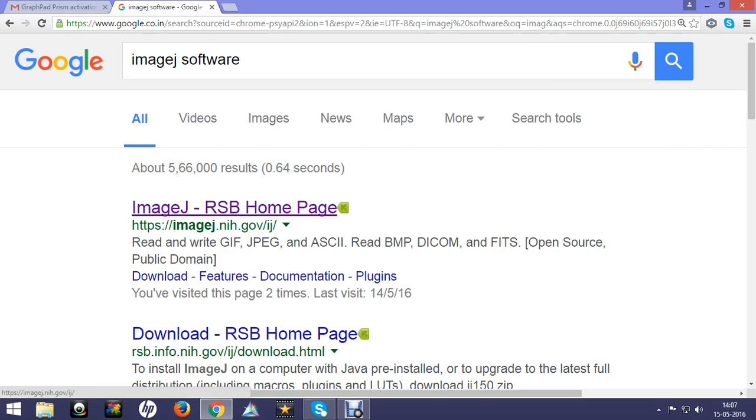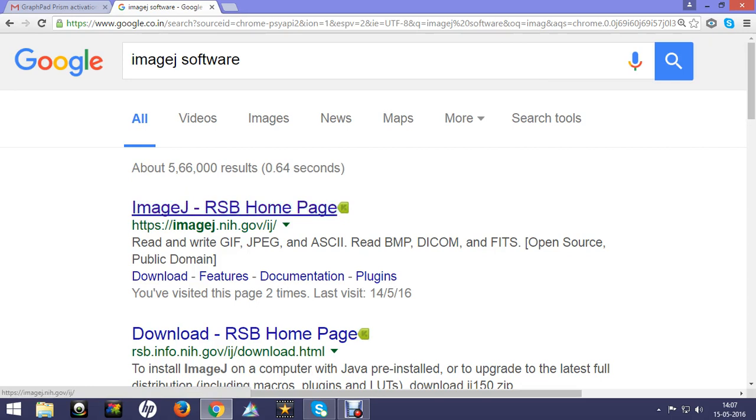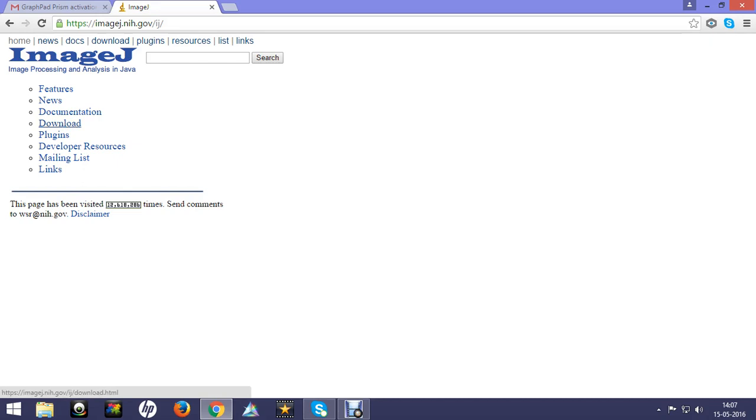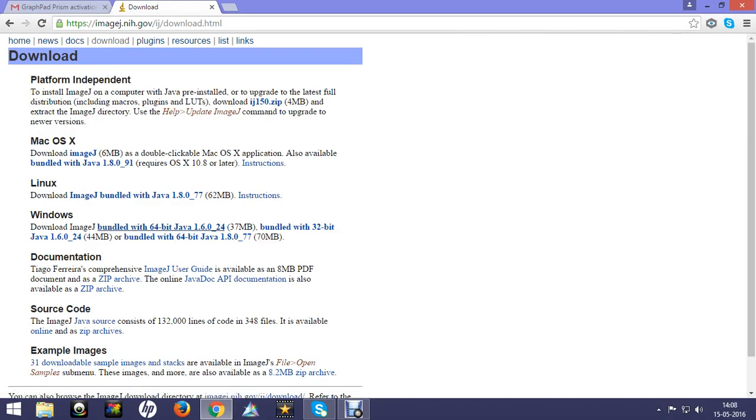It will open the NIH website. Click on that. There is an option for download. There are separate options for Mac and Windows, and under Windows there are options for both 32-bit and 64-bit computers.